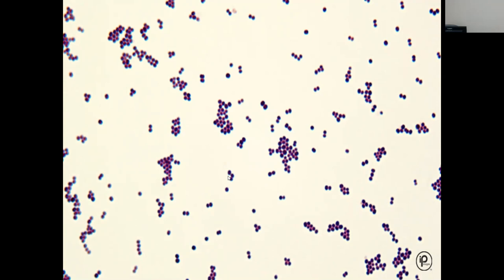So you kind of need to get a whole picture of the whole slide. Because you know this was one organism that you picked off. You picked off one colony from your growth media, and you put it on your slide, you gram stained it, and you see that you got clusters, you got three, you know, there's no triplicate, it's always just diplo. So that's probably not a true diplococci organism.